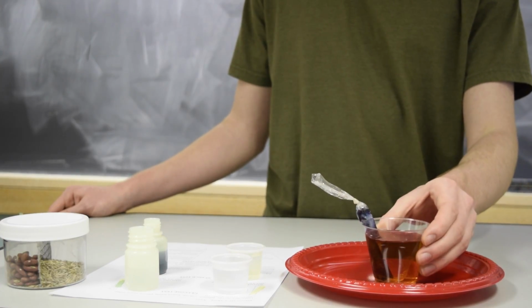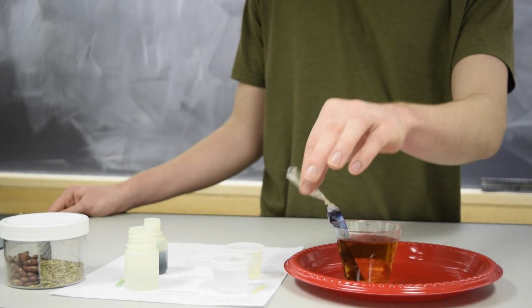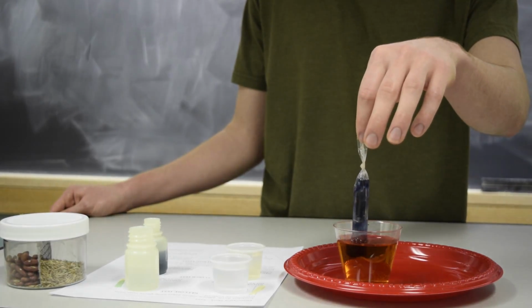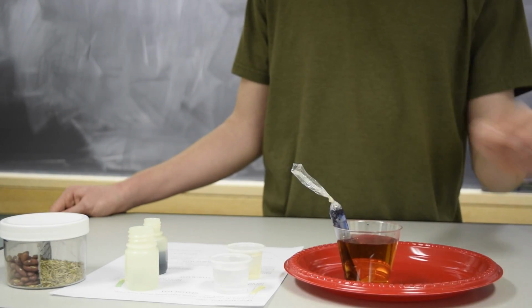If the water outside the dialysis tubing turns black, that means the dialysis tubing that the students were using had a leak in it, and they should work with another pair of students.